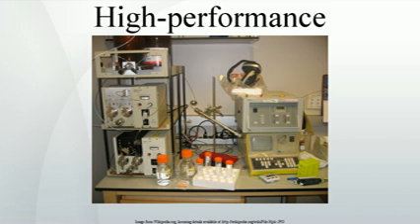Larger columns are usually seen in industrial applications, such as the purification of a drug product for later use. Low ID columns have improved sensitivity and lower solvent consumption at the expense of loading capacity. Larger ID columns, over 10 mm, are used to purify usable amounts of material because of their large loading capacity. Analytical scale columns, 4.6 mm, have been the most common type of columns, though smaller columns are rapidly gaining in popularity. They are used in traditional quantitative analysis of samples and often use a UV-vis absorbance detector.